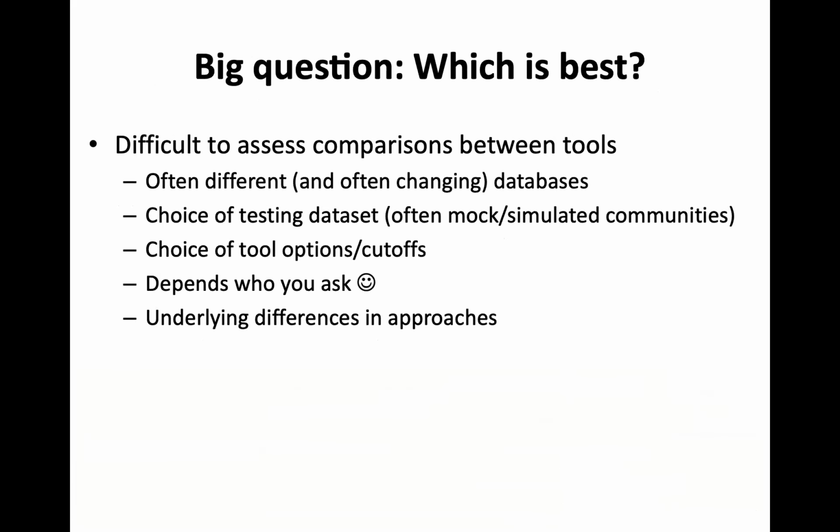Okay, so those are the two major approaches: the general all-reads approach and the marker-based approach. And then the big question is, okay, so I have my data, and I don't care about all the methods. I want to know what method to use. So, which one should you use? This can change over time, especially as databases grow.